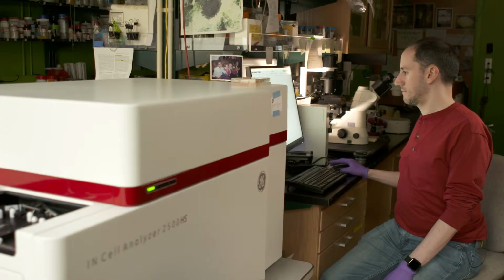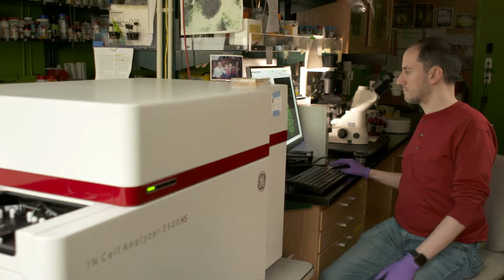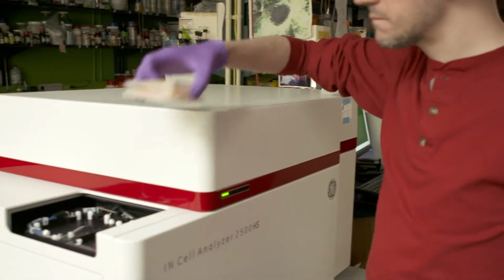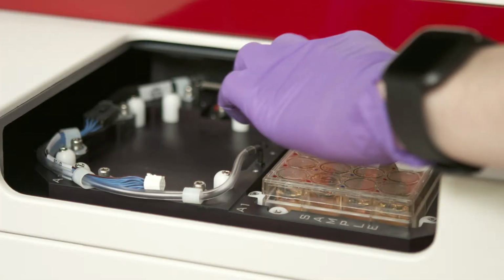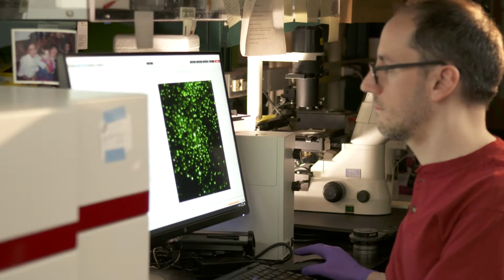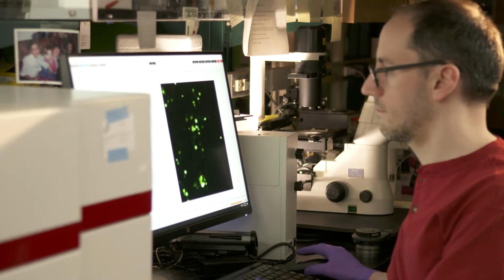At the University of Washington in Seattle, scientists are researching how cell division impacts human disease. Their research can be used to understand the onset and progression of cancer at a mechanistic level. If you want to understand how cells have become chromosomally unstable so that they make a mistake every 10 or 100 cell divisions, which is much more important for understanding human disease, then once again, you really need to be able to watch the cells over many cell divisions.